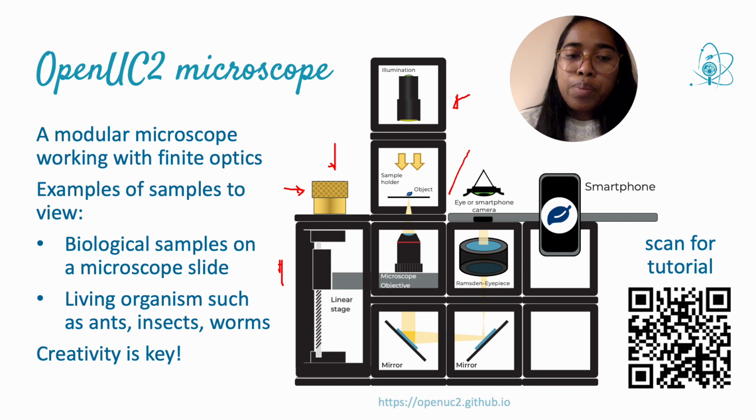And the examples of samples to view include biological samples on a microscope slide or living organisms such as ants, insects, and worms, and we really encourage creativity to play here, especially with living organisms if time allows.